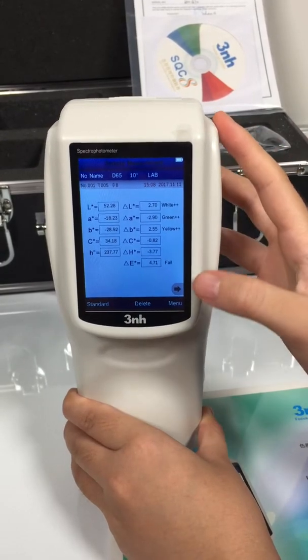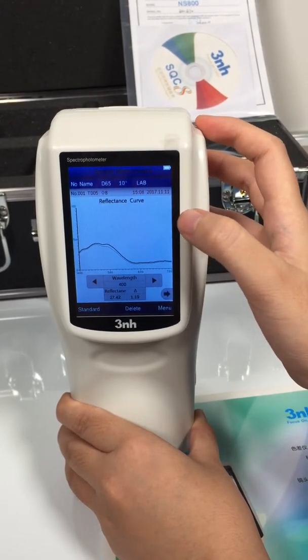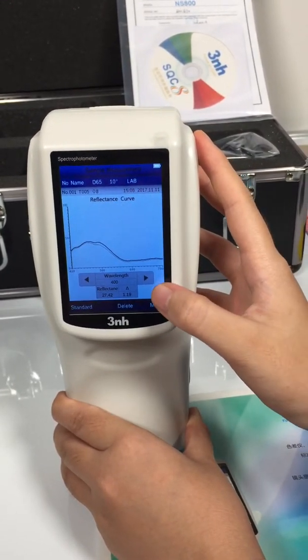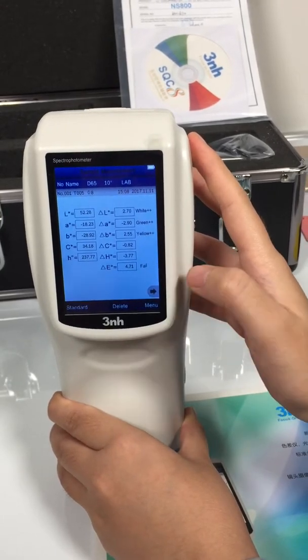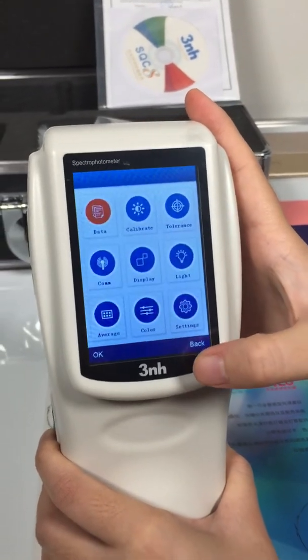Okay, then we can see the reflectance curve. Then the menu is finished. We can see the data.